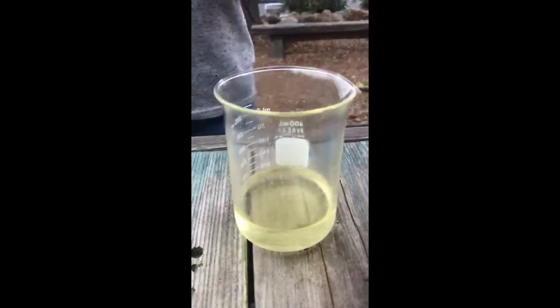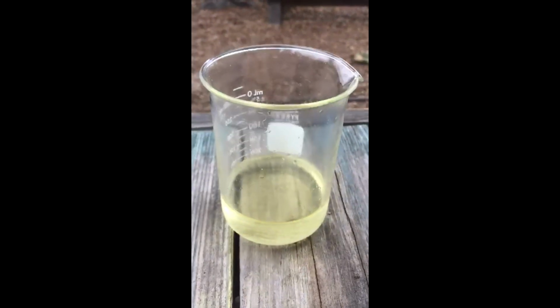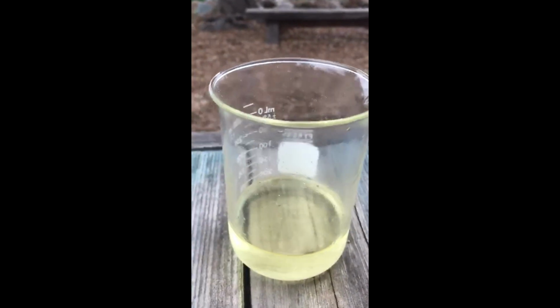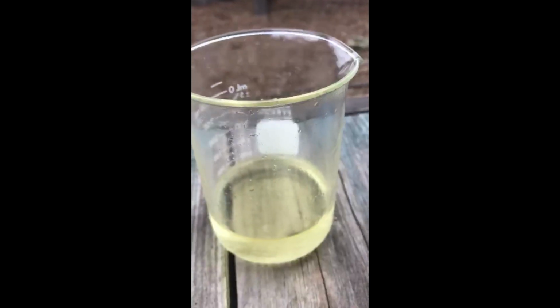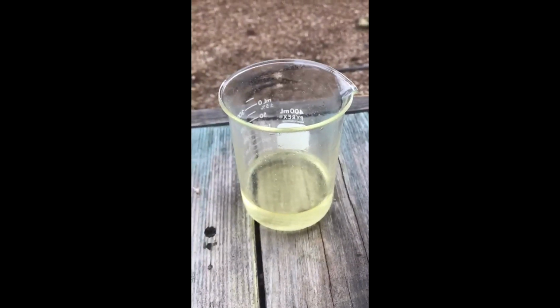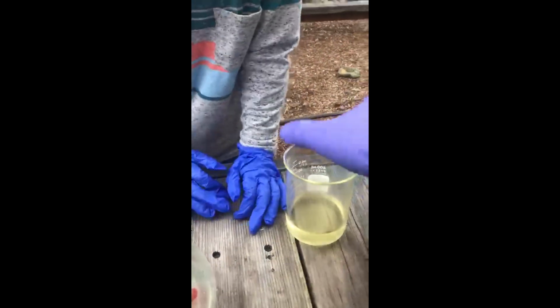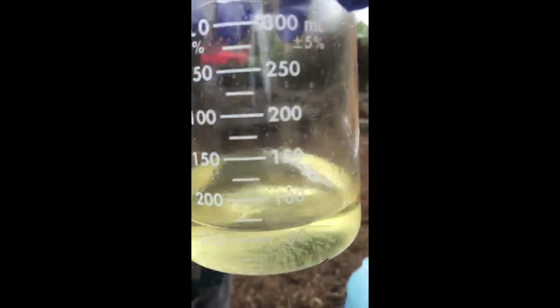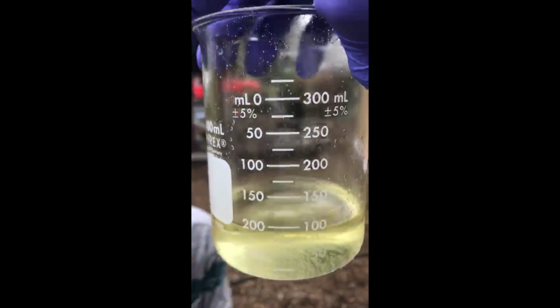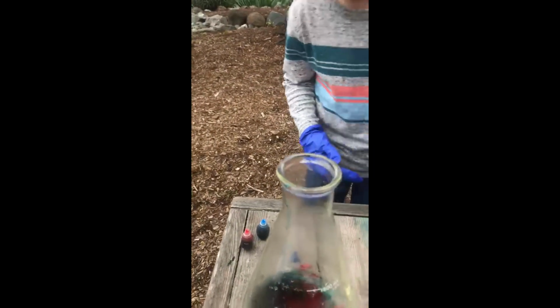This is a saturated solution of potassium iodide, okay? Or sodium iodide works as well, but I can't remember which one works better. We're going to find out. So basically a saturated solution is a solution where we dissolve as much potassium iodide or sodium iodide as we can in about 50 or 100 milliliters of water. That's about 100, okay? So, the last step is that you pour it in and back up.